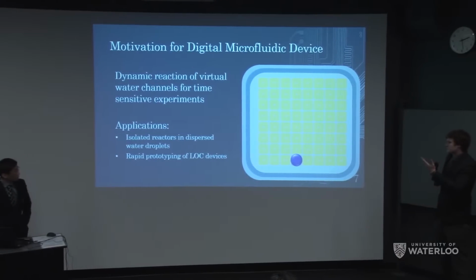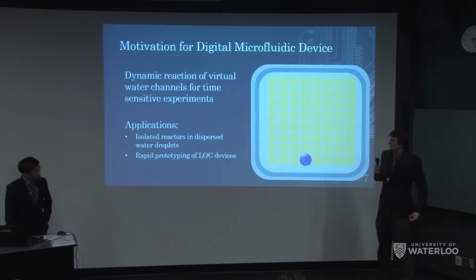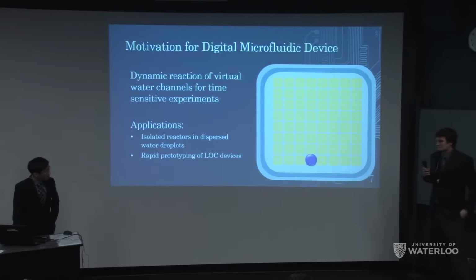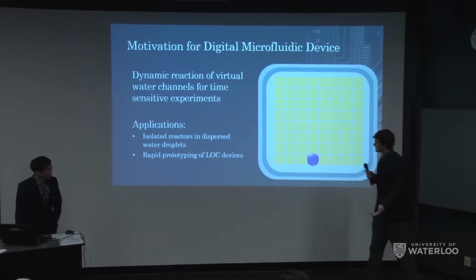So all the while, this is an additional application. And from your product, you can expose it to different areas on the chip, be it a pH gradient or an additional electric field.